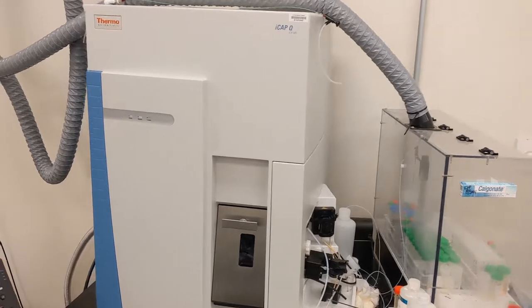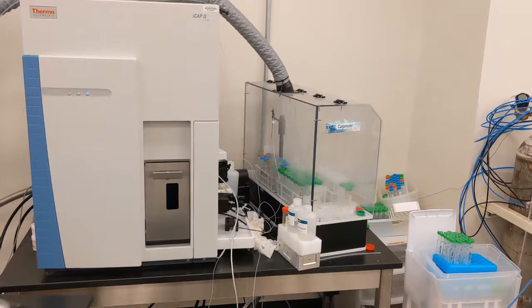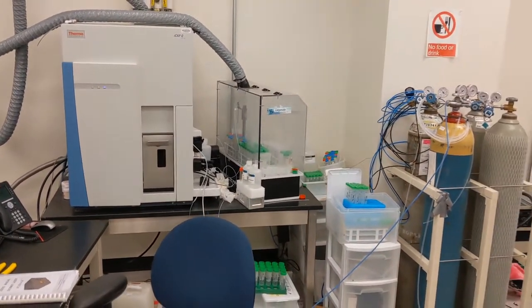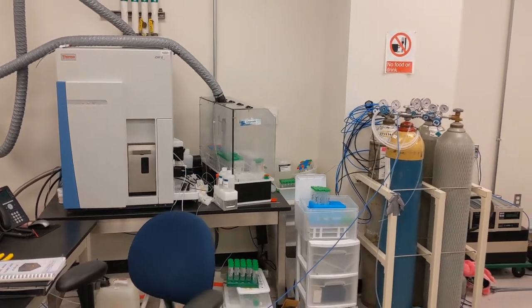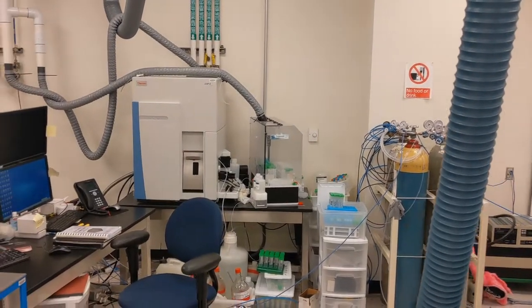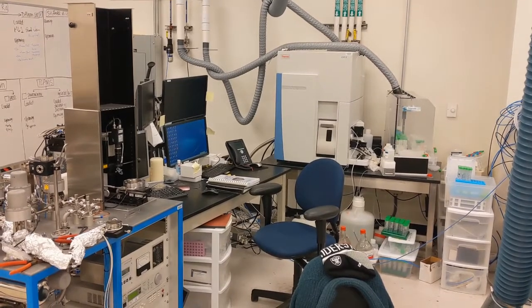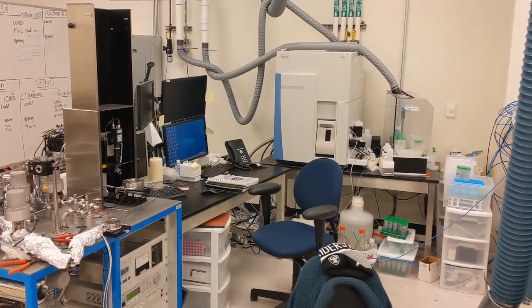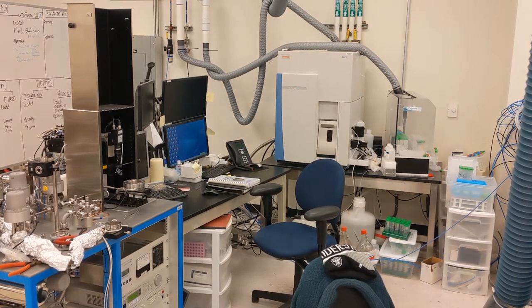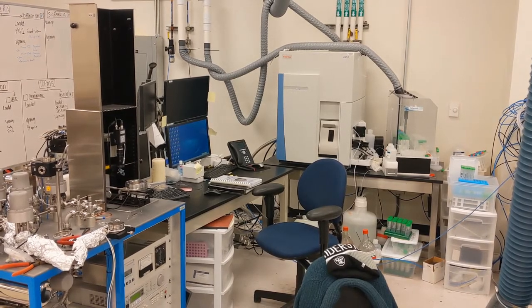We are also able to do uranium lead dating using this machine. We do this in situ with the laser ablation mode, and we drill a small pit and we measure the uranium, thorium, and lead content of the crystal. We are also able to do certain things such as rare earth elements at the same time. For example, if we are trying to look at the crystallization age of a granite, we can measure the uranium, thorium, lead date of a crystal, and we can also measure the rare earth elements at the same time, and that will tell us some of the conditions that that crystal crystallized in.